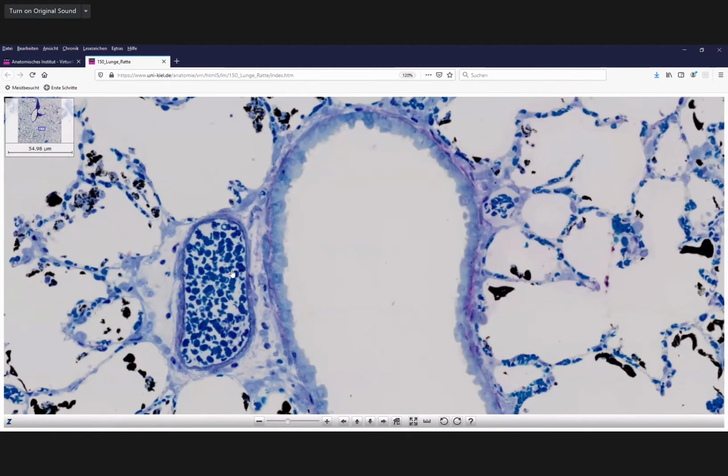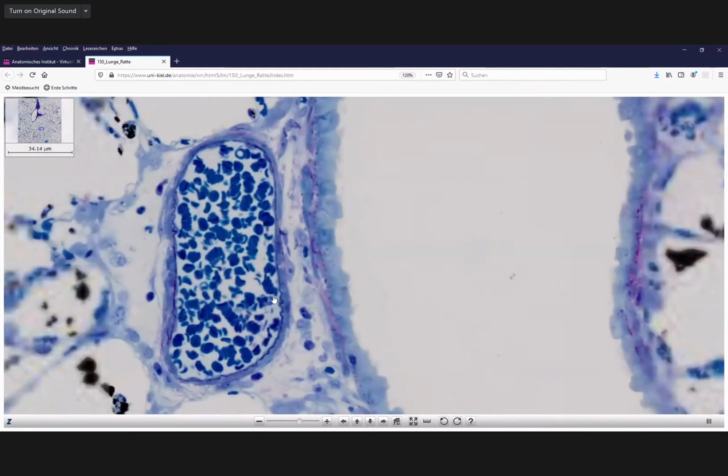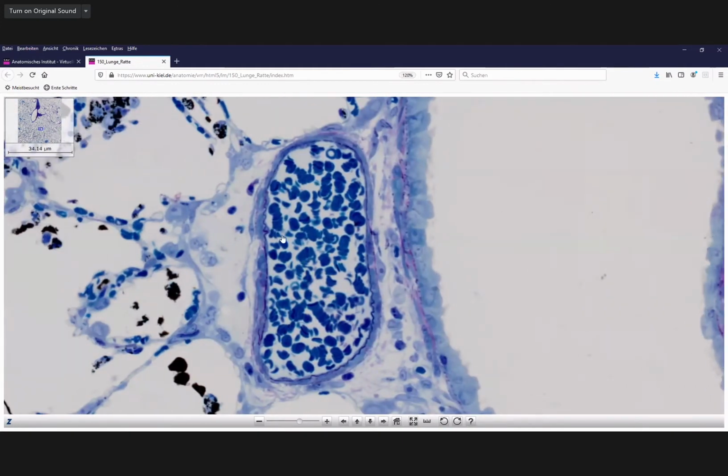They are stained blue now here in this methylene blue technique, but when we zoom in, you can see nicely now the red blood cells. Look at here at the bottom, there is an endothelial cell with the nucleus bulging forward a little bit. So this is the very thin, here's another cell body of an endothelial cell. Here's another one here. Here's a nice one, here's a nice one. Here are two.